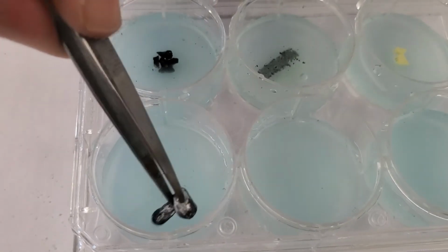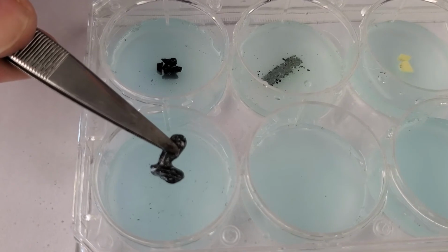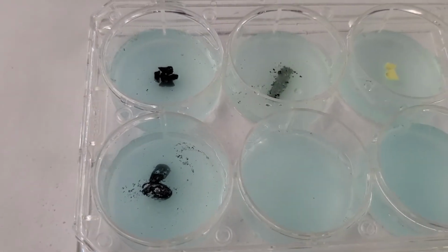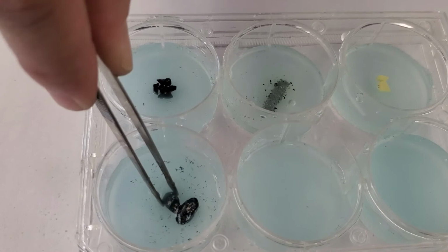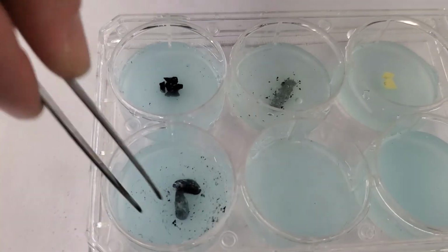I can't shake it off yet, but you can see the bottom of it and what color it changed right away. And you can see the little darker spots that fell off. You can see both sides now. Definitely changed color.